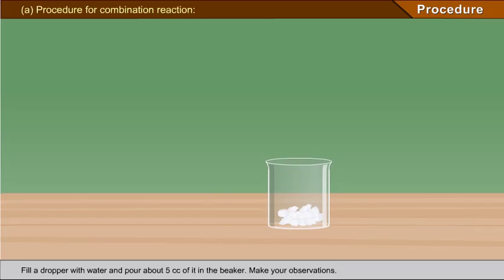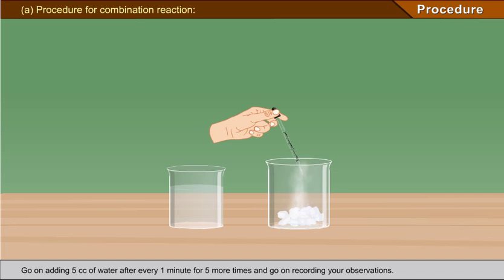Fill a dropper with water and pour about 5 cc of it in the beaker. Make your observations. Go on adding 5 cc of water after every 1 minute for 5 more times and go on recording your observations.